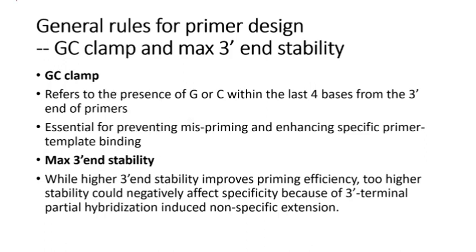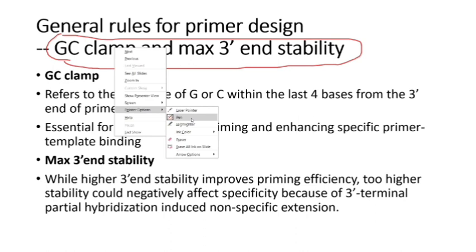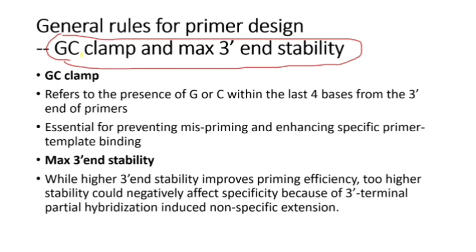So let us see the rules of the primer. This you need to keep in your mind. If you are not designing the primer with Primer3, if you are designing your own, you can manually design the primer. If you are designing manually, you should keep in mind all these rules. I can't go directly to Primer3 and show you how it is. You should know how we design a primer.